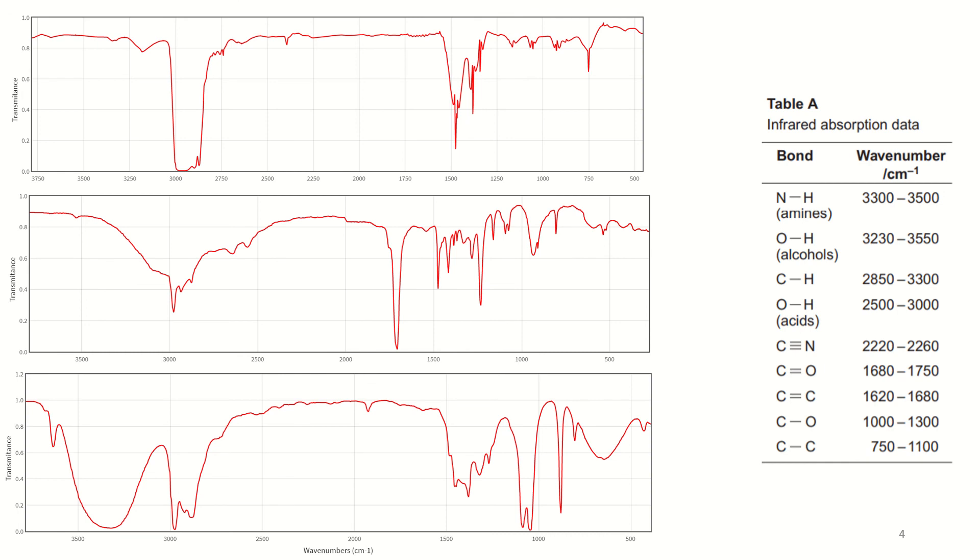A few more functional groups just to go through. So we've got in here either just straight up alkane, carboxylic acid, and I've got an alcohol. So the alcohol we saw earlier, it's got this big broad peak, high region, this here. The carboxylic acid, we're looking for the carbonyl group. 1680 to 1750. Quite clear to spot.